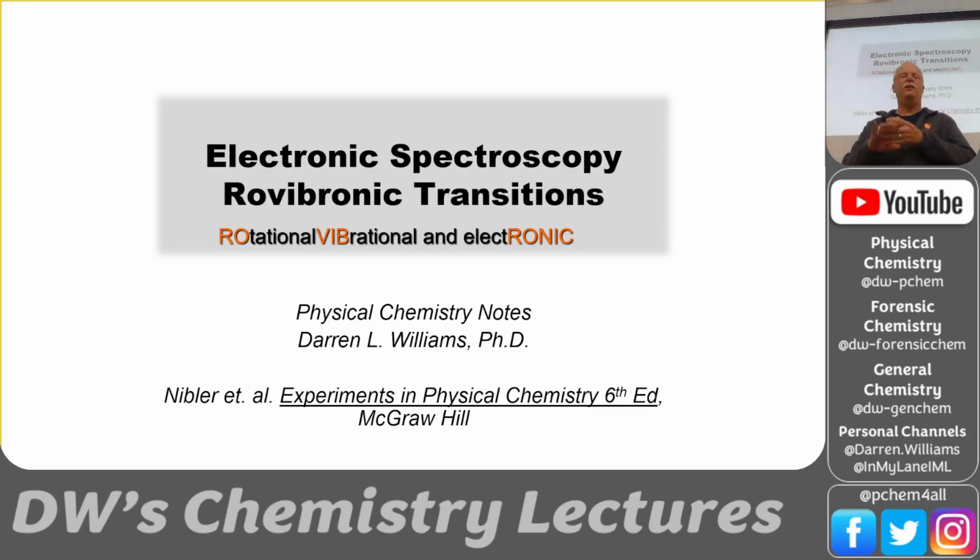And the thing is, we won't resolve the rotational lines, because we just don't have a high resolution enough spectrometer. You can resolve these Ro-Vibr-Onic transitions if you have a super high resolution laser, and we were able to do that in my graduate work. We had a really good laser lab, and we could resolve the emission lines for the iodine. It was pretty cool.